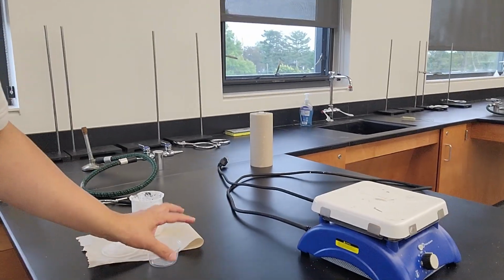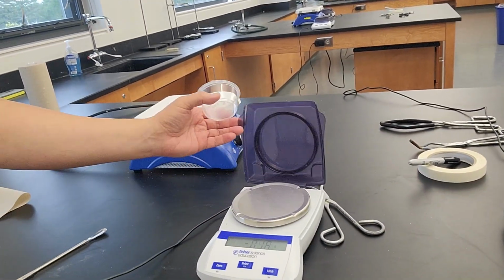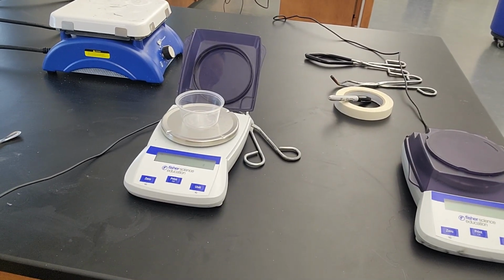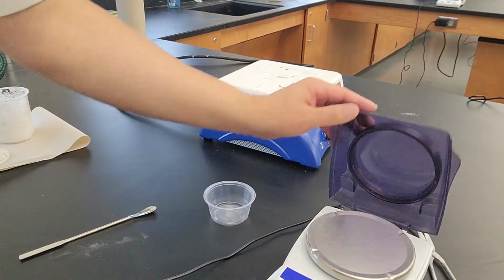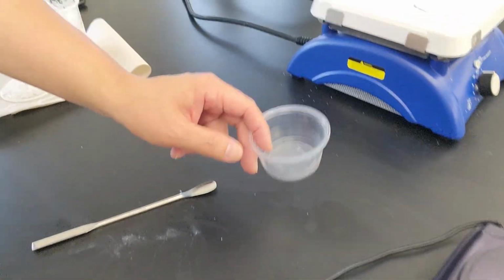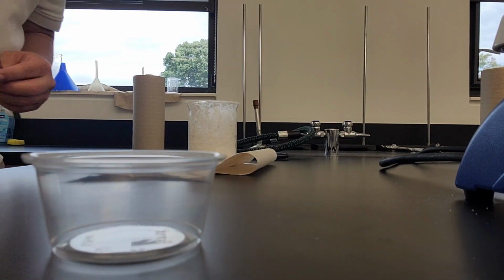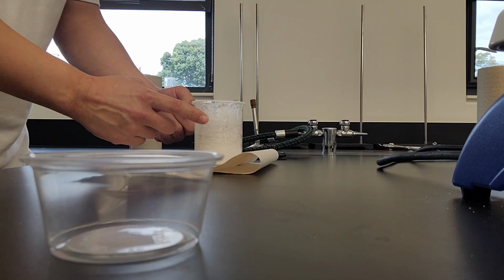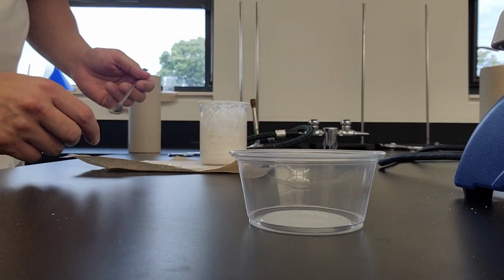Change the angle up on you one more time. Got a new weigh container. Got that zeroed. Now I'm going to see if I can get as much salt in there as I can. I'll give that a little more time to cool off.